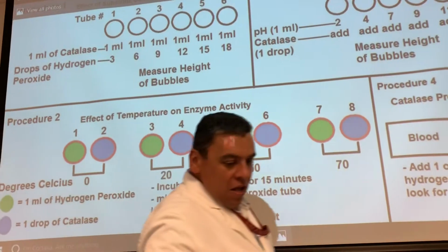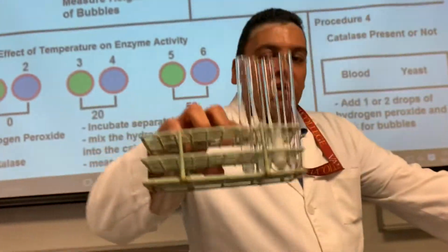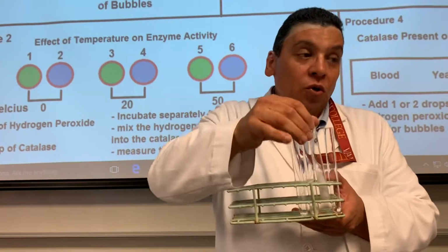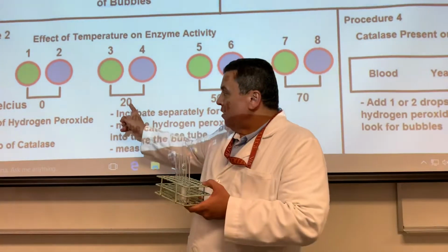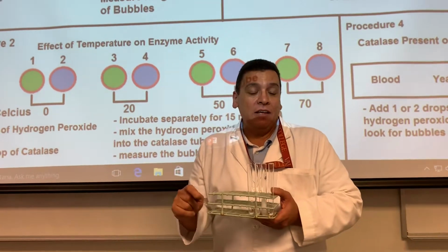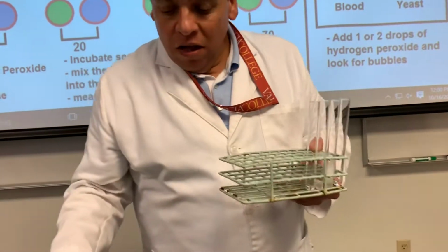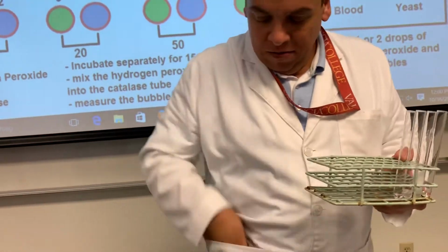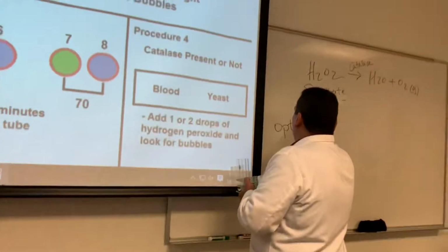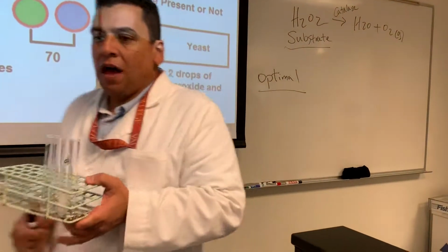Good. So, did you get the picture of that? Okay, good. So you're gonna graph this. Now listen to me, please. Let's assume that this temperature had the highest activity. There's a name for that, and it is called optimal temperature. Optimal, the best.